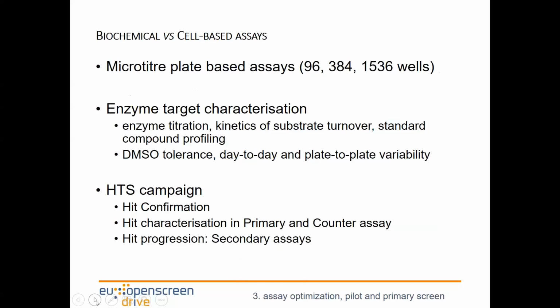And if you are using an absorbance-based assay, that may well also use a plate with a clear bottom. For fluorescence-based assays, TR-FRET, alpha screen, luciferase reporter, you will use, say, a particular colored plate, white or black, and that doesn't necessarily need to be see-through from the bottom.